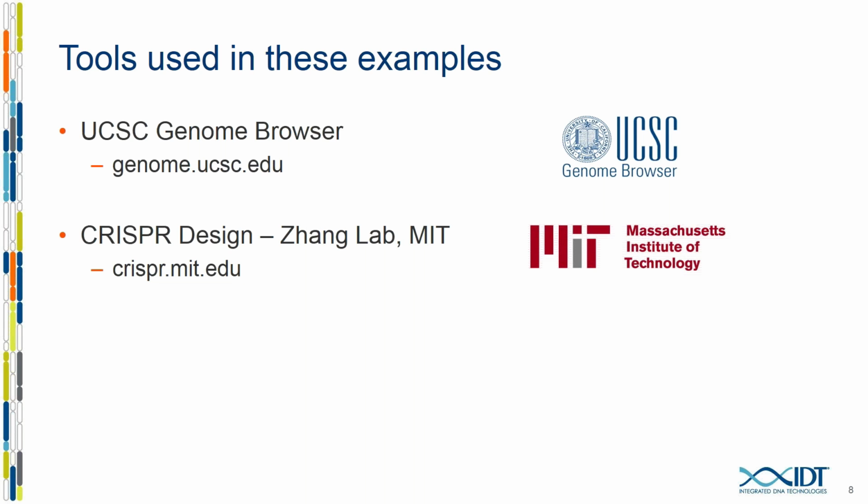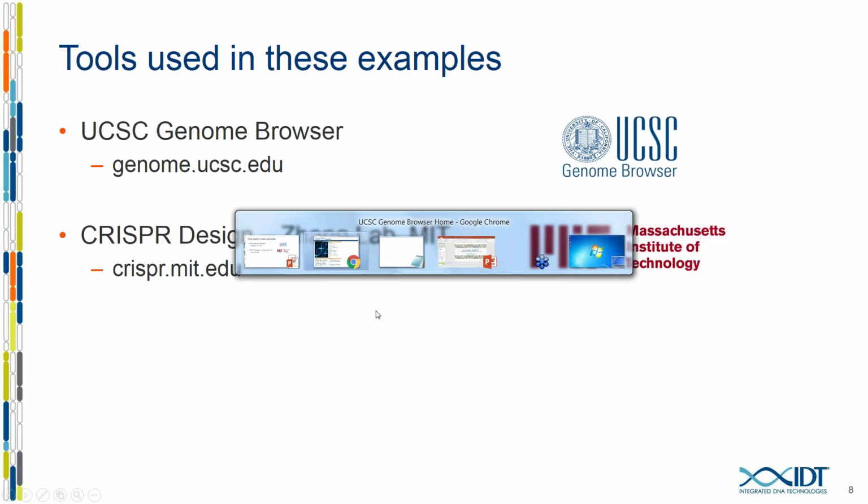The latter tool is very convenient if you don't have a commonly used genome. So the genome browser track only works for a number of species, and sometimes you can use the MIT tool for an even wider number of particular species.